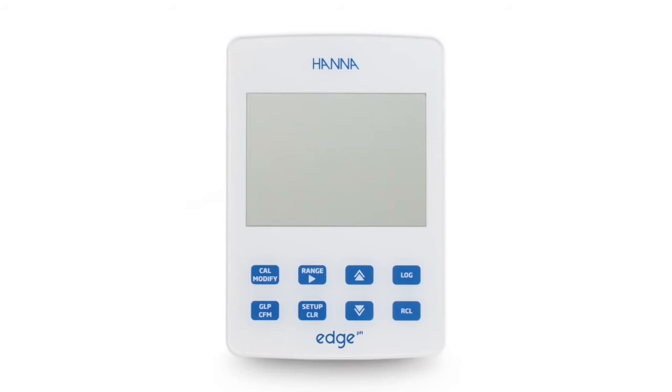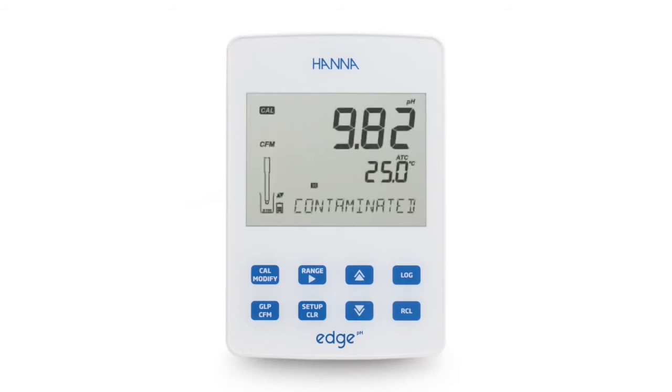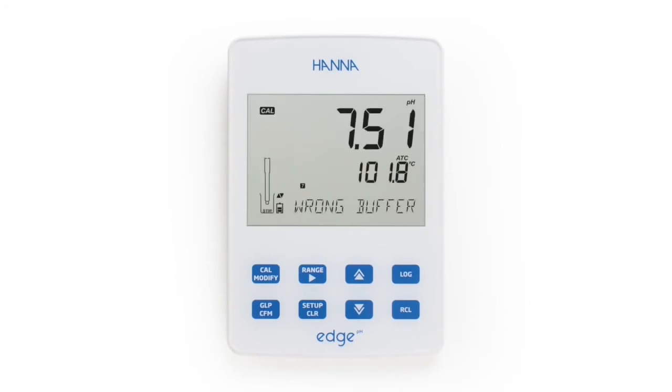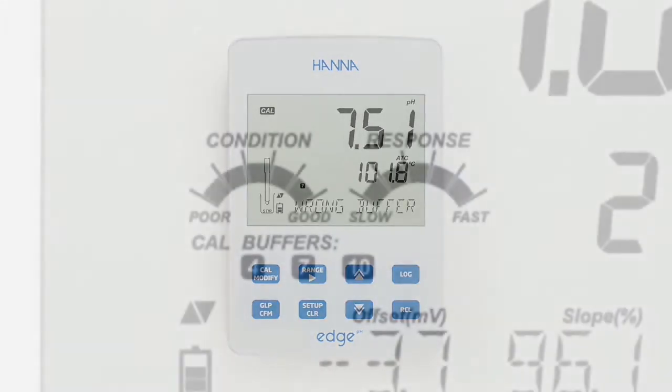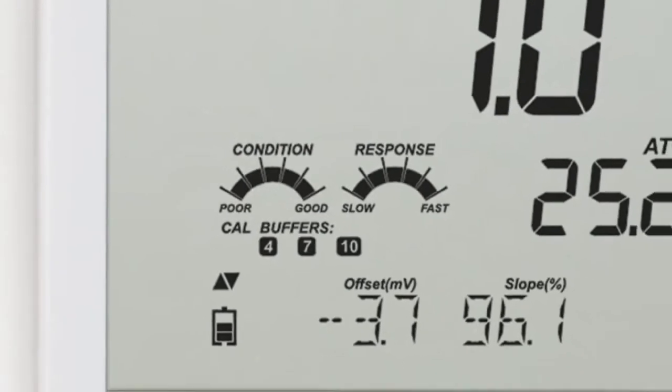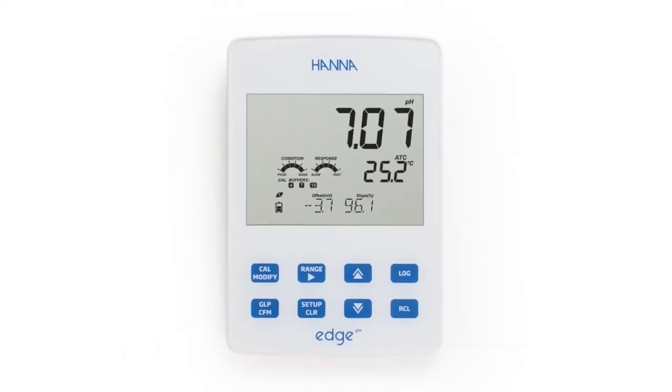The HI2002 is equipped with Hanna's exclusive CalCheck feature. CalCheck monitors electrode behavior over time and uses this data to alert the user of potential problems such as a dirty electrode or contaminated buffer solution. The HI2002 will also alert the user if the temperature of the calibration buffer is out of range. After calibration, the overall electrode condition is displayed on the measurement screen. CalCheck ensures stress-free, accurate, and reliable measurements.